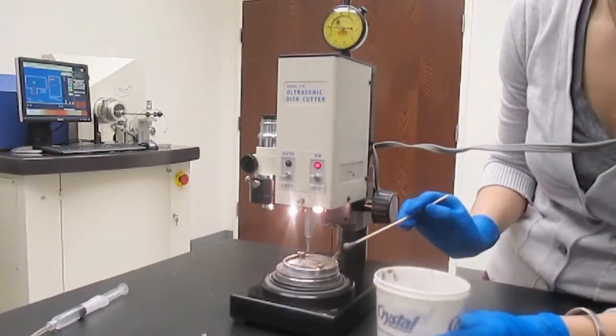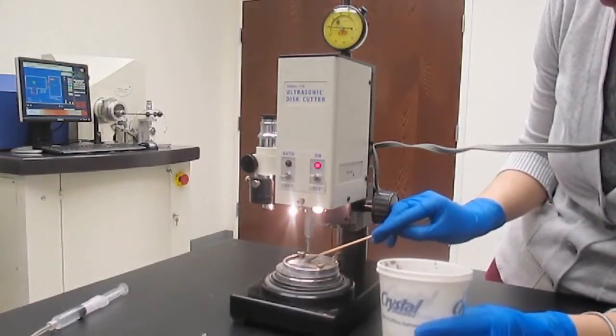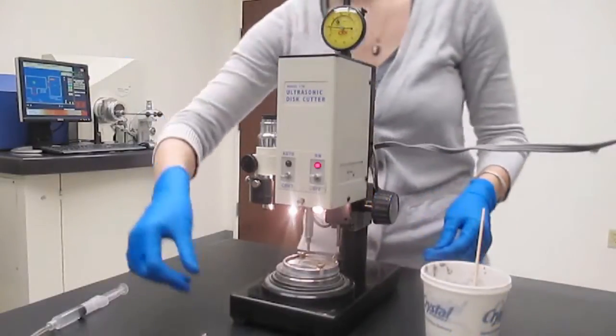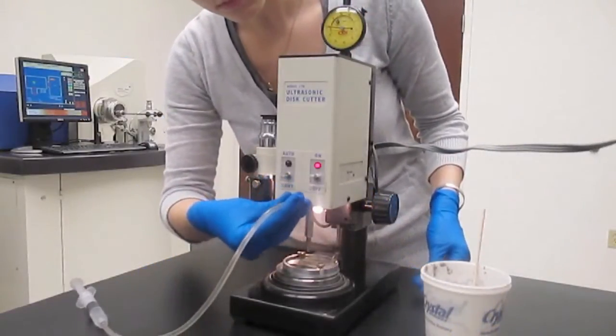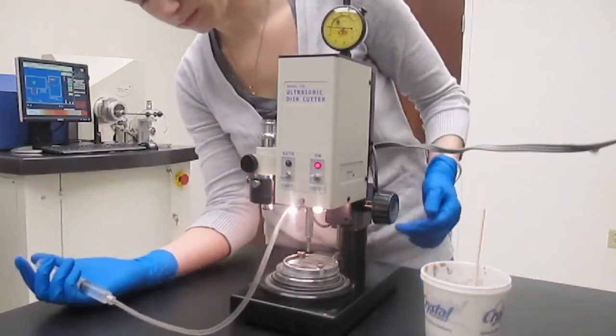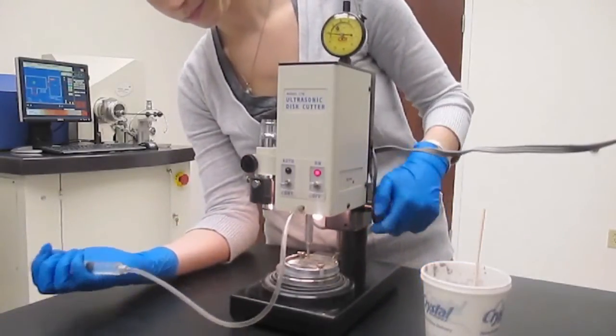Add silicon carbide abrasive powder to the surface of the glass beneath the cutting tool. Attach the syringe to the front of the disk cutter and add water from the syringe onto the surface of the glass. The silicon carbide powder will become a paste.